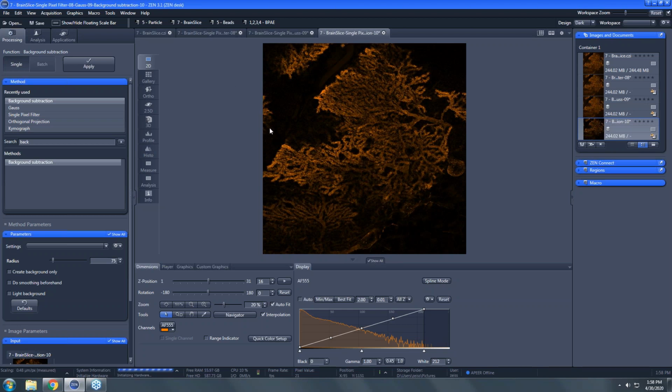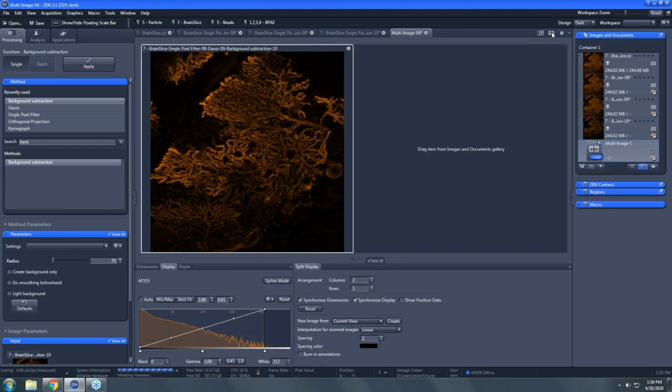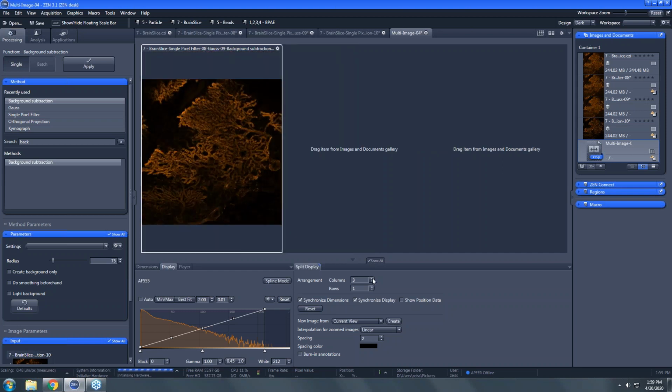Great. Okay. This image looks lovely. Yeah, so we get higher contrast. If you make a multi-image figure of this, then we can zoom in on different regions and really get a feel for what's going on across. So let's, you know what to do here, right? Yeah, you got it. There we go. Can we do 4 across and do each one of them? Yep.